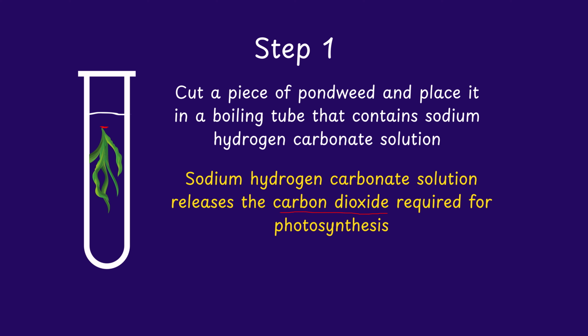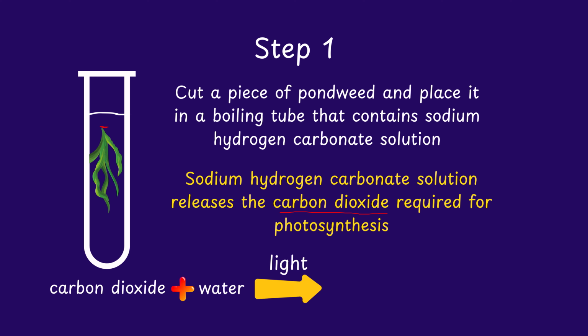Let us look at the equation for photosynthesis. It is carbon dioxide plus water, in the presence of light energy, to produce glucose and oxygen. So the sodium hydrogen carbonate solution will release the carbon dioxide that is required for photosynthesis.